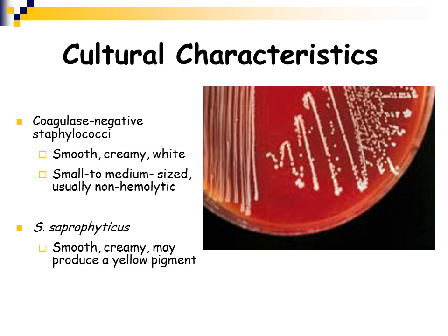Staph saprophyticus may have a yellowish pigment, but it usually is non-hemolytic, whereas Staph aureus has more of a golden pigment and it is beta hemolytic. So usually on blood agar plates, an experienced clinical microbiologist will be able to tell the difference just by looking at the colony morphology, pretty much almost exactly what organism they're looking at.